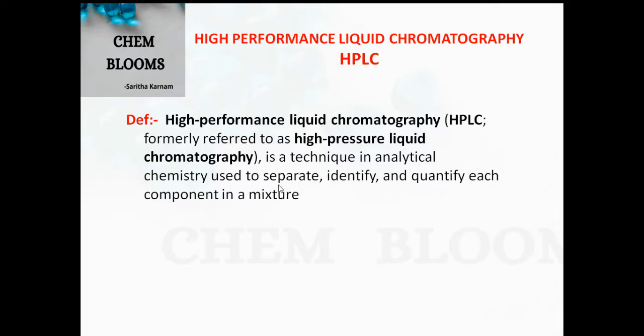So we can use this technique for the separation of the components. Then we can also identify, that is, the nature of the components, and also the amount of the components which are present in the mixture.